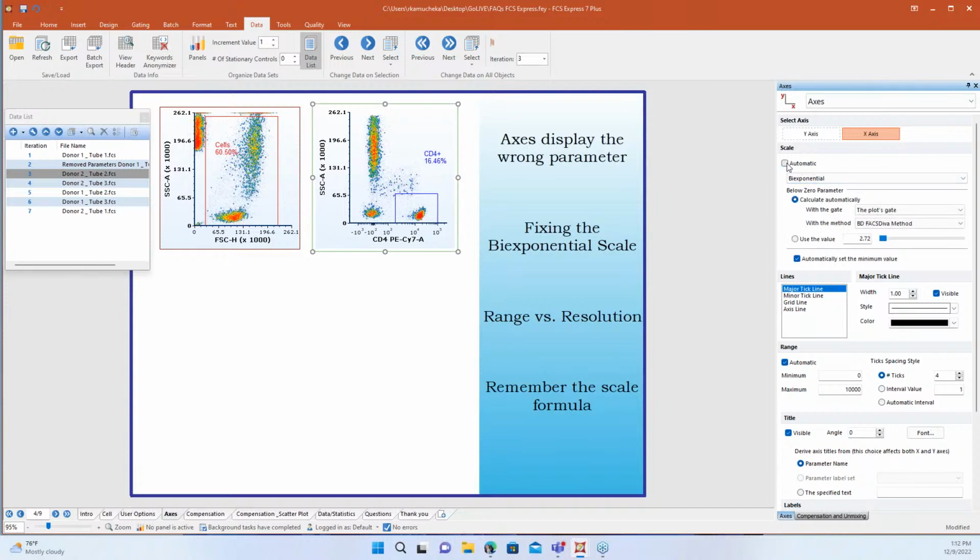If I uncheck this automatic box, I can either calculate it automatically, but this will also sometimes lead to some shifting if I let it calculate using this method. So you can also set a value. If I wanted to be very specific here, I can say, okay, I want my data to look like this. I can use this slider bar to adjust it. Maybe that's a little much. Maybe something like this is great. And this is how I want to use this value. Then when I pop to the next one, I don't see those shifts that I saw before. It's got that same nice scaling, and I'm just seeing my data move. It shifts up and down a little bit on that side scatter, but it's not moving left to right anymore on that X parameter.